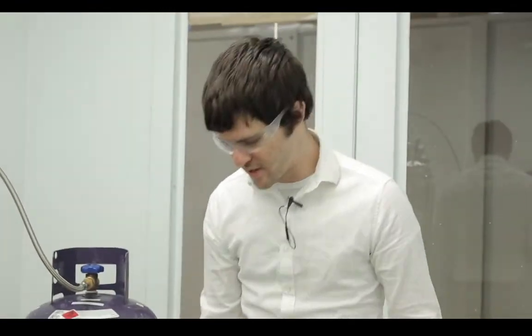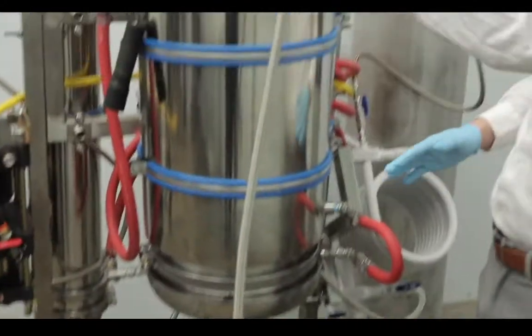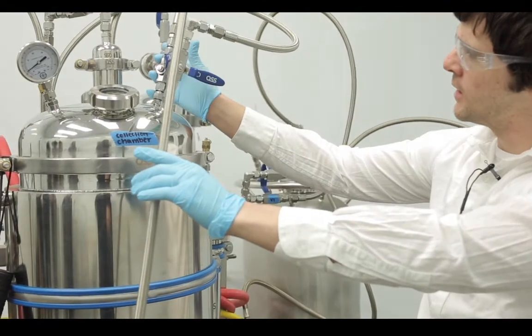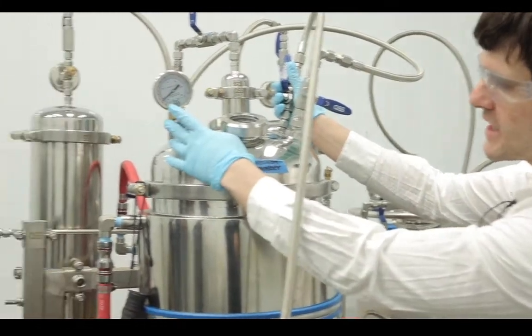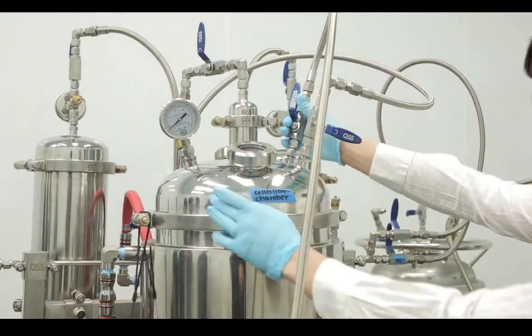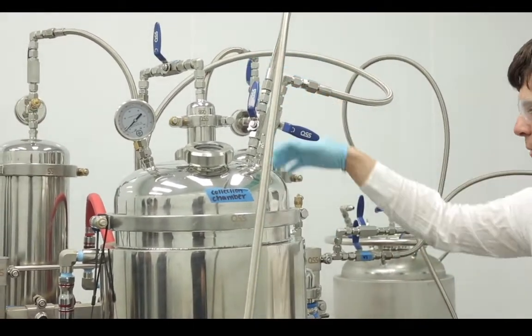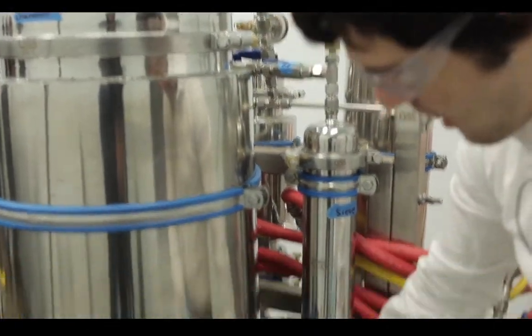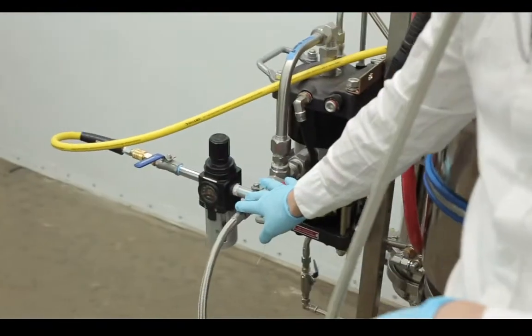So to begin the vacuum procedure, we want to turn on our vacuum pump. You can hear that. We will follow our stainless steel line to our accessory port on our solvent recovery system, and we will go ahead and open that valve. We will begin to see the vacuum dropping on the vacuum gauge. From our valve, we want to vacuum down the back half of our machine. So we will open to the bottom of our molecular sieve. Red ball valve means stop.